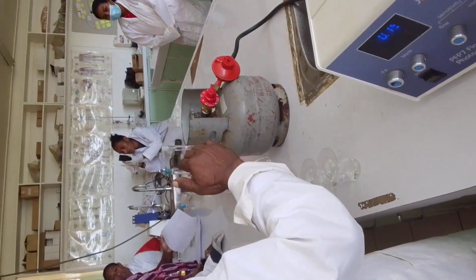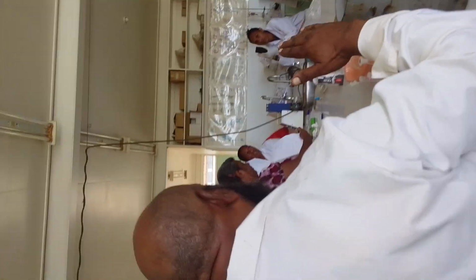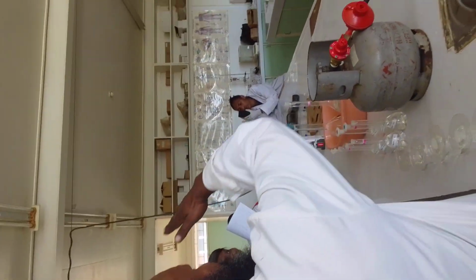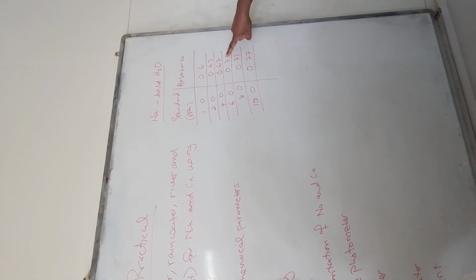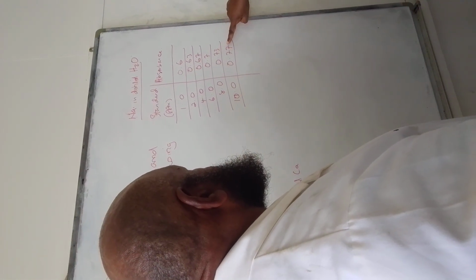Generally, you want to see it in the slope. Yeah, that's it. Give a good slope. 0.04 difference there. 0.0334.